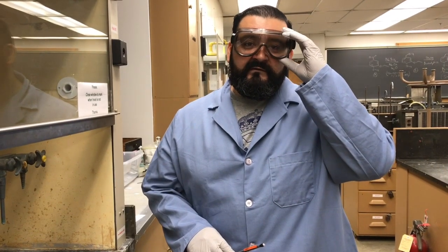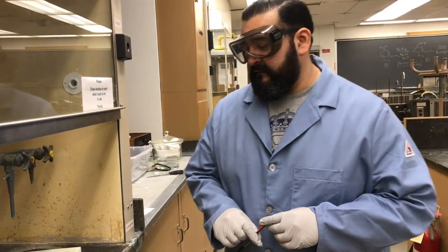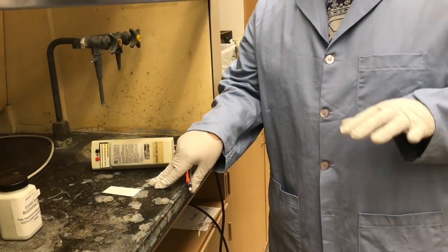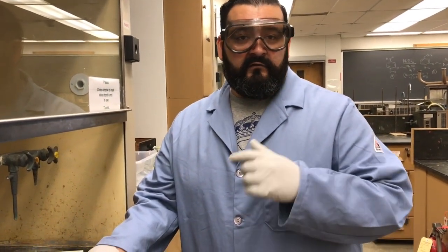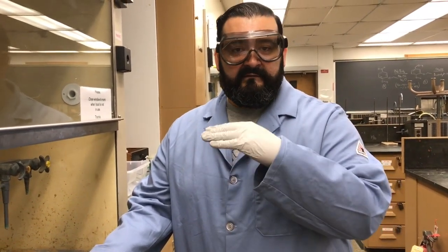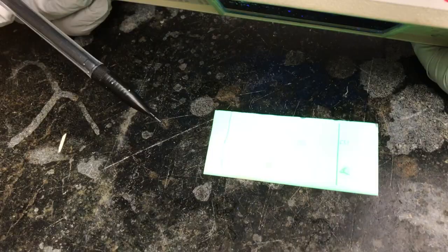So hey everyone, we're back with part 1 for our TLC. This is the conversion of our aldehyde into an alcohol. When we take the TLC, we know that we have two very different functional groups, so we can also deduce what the outcome should be. We know that an alcohol group is more polar than an aldehyde, so we should expect the alcohol to remain at the bottom and the aldehyde to move further up the plate. So let's see if that's what we have.